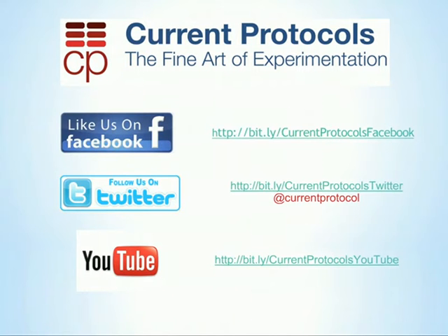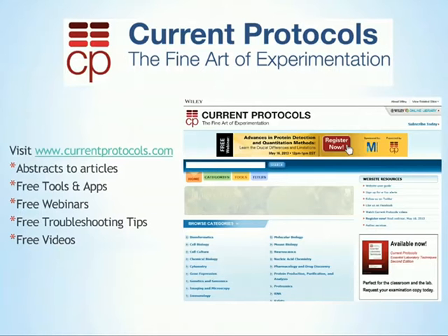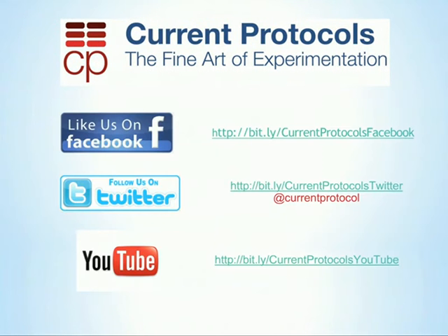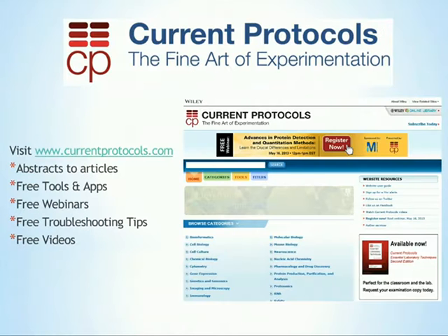That's a good question, and one that can be faced regularly if you are targeting something that's more of an unusual protein. You might have an antibody against something you synthesized a peptide for, but you don't have a good protein standard. And sometimes it takes a lot to get high quantities of purified proteins. It can be an expensive process.